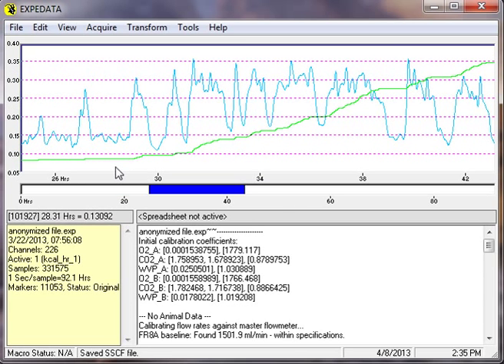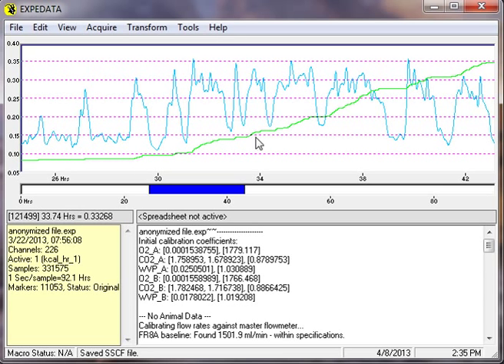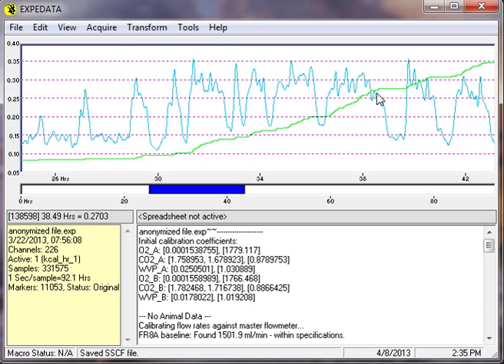And there you can see that as the pedestrian meters increase we get these large increases in energy expenditure. And you can see where the increase in meters run is flat, i.e. the mouse is keeping relatively still, we have low EE and high EE during the time when the mouse is actually moving around the cage and ramping up its cumulative meters.